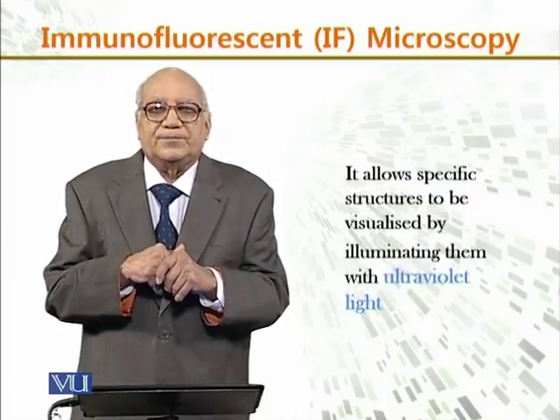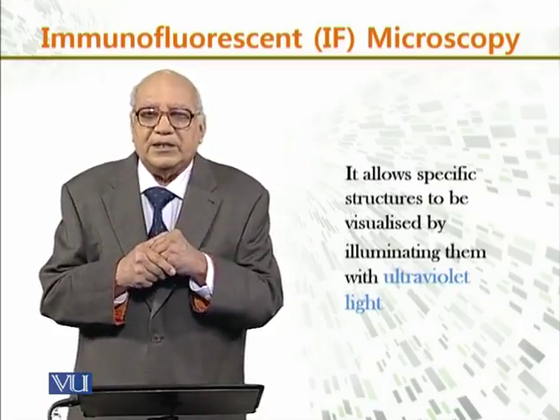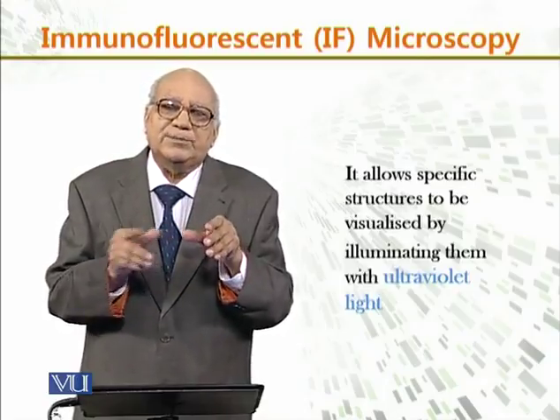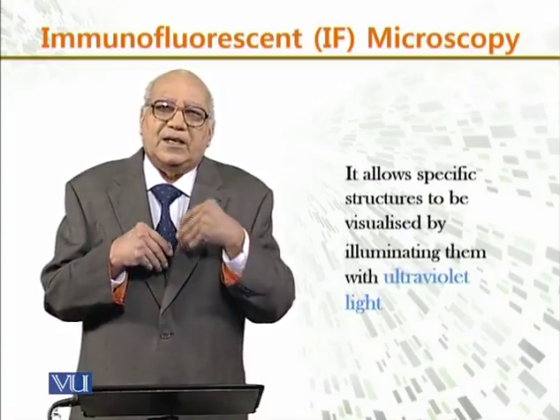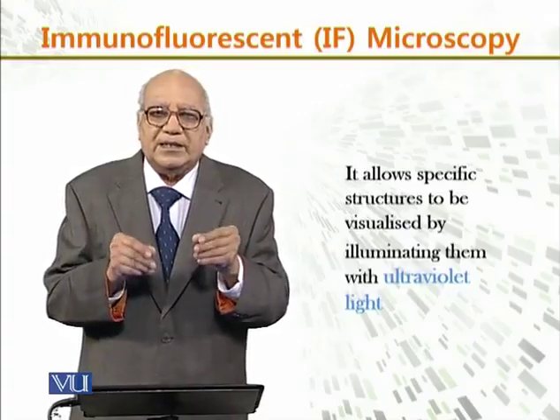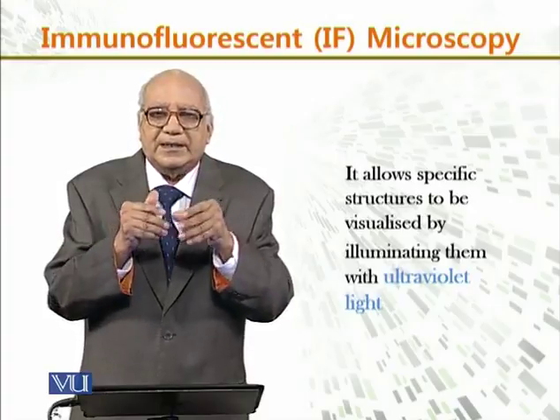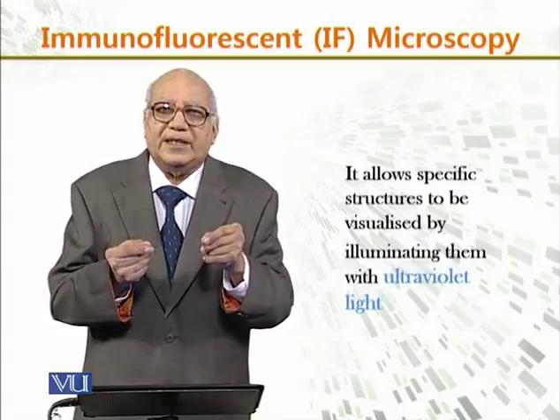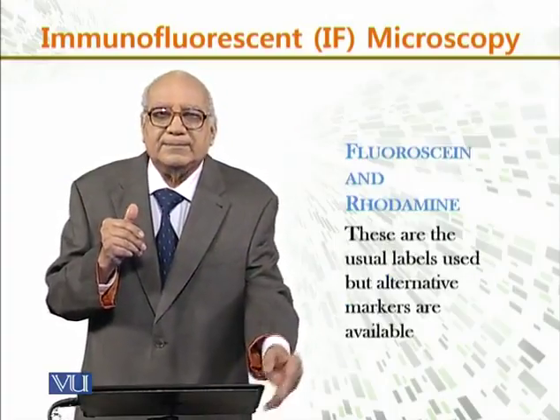Now, it allows the specific structure to be visualized by illuminating them with ultraviolet light. So you see, previously we used spectrophotometry or other things to determine the concentration, but here we can use ultraviolet light for illumination, as UV light, as a matter of fact, reacts with the fluorescent antibodies.